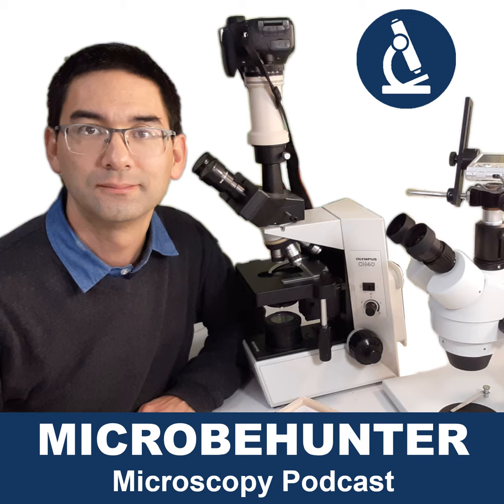Another reason why compound microscopes might be an advantage, if you have not decided yet, is because the microscopy community, most of those amateur microscopists actually have compound microscopes. They might all have stereo microscopes as well, or many of them might, but it is more likely that a person with a compound microscope has a stereo microscope in addition to it. There are fewer folks where it's different. There are some people who collect stereo microscopes and who may have made that their primary focus and field of interest. Of course, this also exists. Okay, but I'm just talking about the general vast majority here.